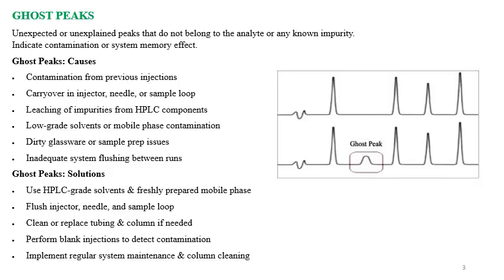As the name indicates, it is unexpected or unexplained. We do not know the exact reason. So these peaks are unexplained peaks that do not belong to the analyte or any impurity. And if ghost peaks are observed, they indicate contamination or a system memory effect.